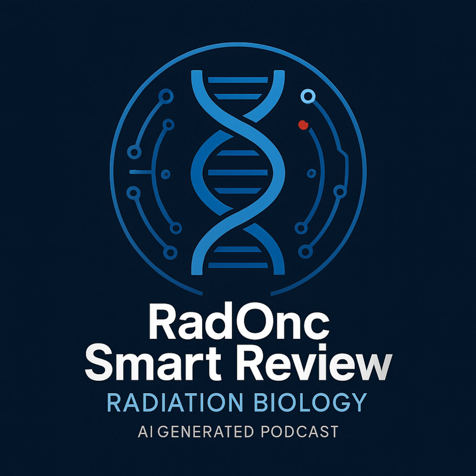And how do we calculate that? We need the control dish again, right? Yep, back to the zero gray control dish. The formula is straightforward. PE is just the number of colonies you counted on that control dish divided by the number of cells you initially seeded onto that same dish. Colonies counted divided by cells seeded. Right, and usually we express it as a percentage, so you multiply by 100%. PE equals colonies counted over cells seeded, times 100%.